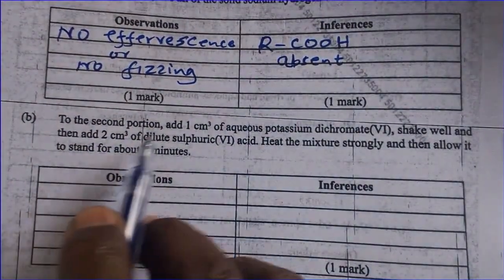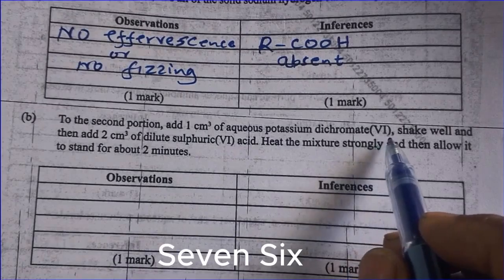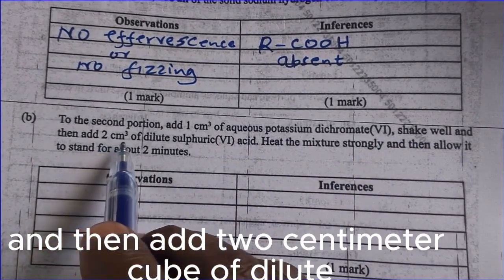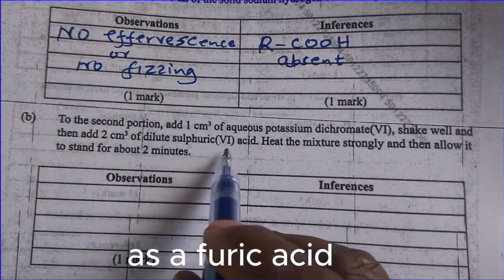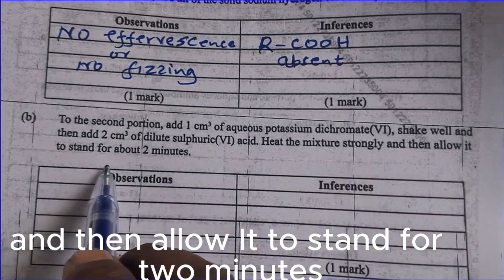To the second portion, add 1 centimeter cube of aqueous potassium dichromate VI. Shake well, and then add 2 centimeters cube of dilute sulfuric acid. Heat the mixture strongly, and then allow it to stand for 2 minutes.